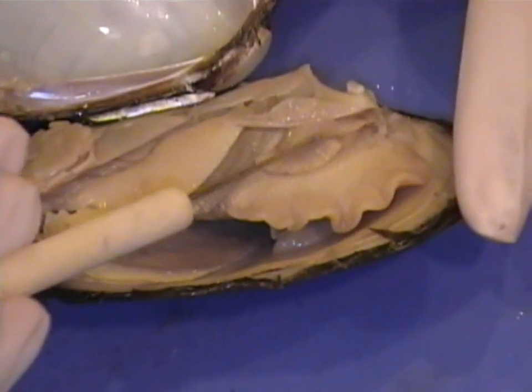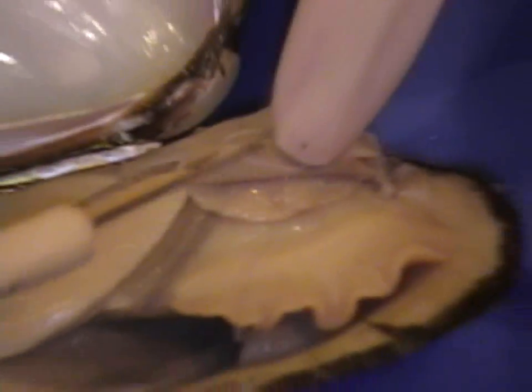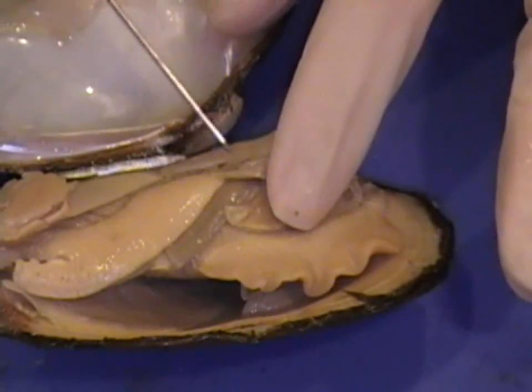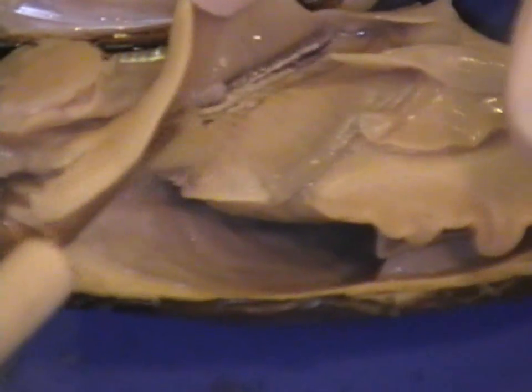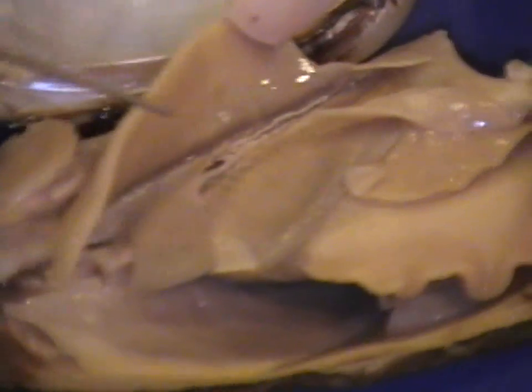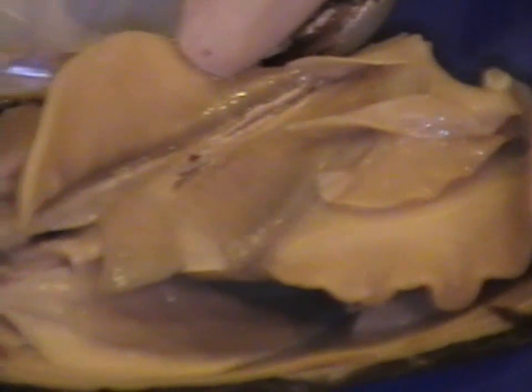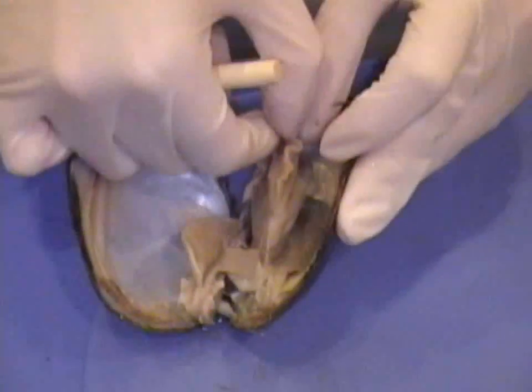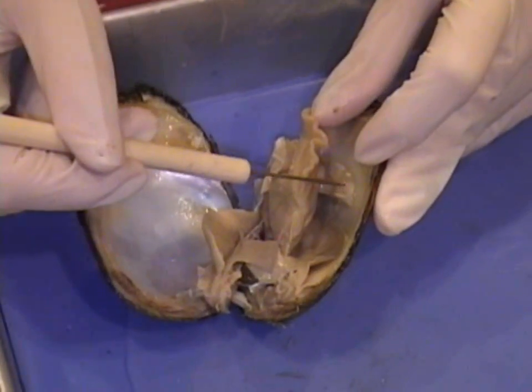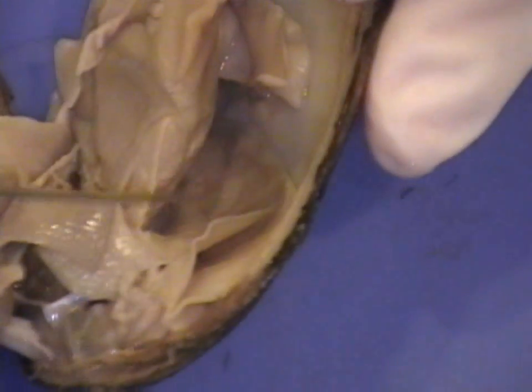Right here we have the labial palp. And we have one set of gills — the outer gill and the inner gill. Taking a look inside, you see the other labial palp and the other set of gills.